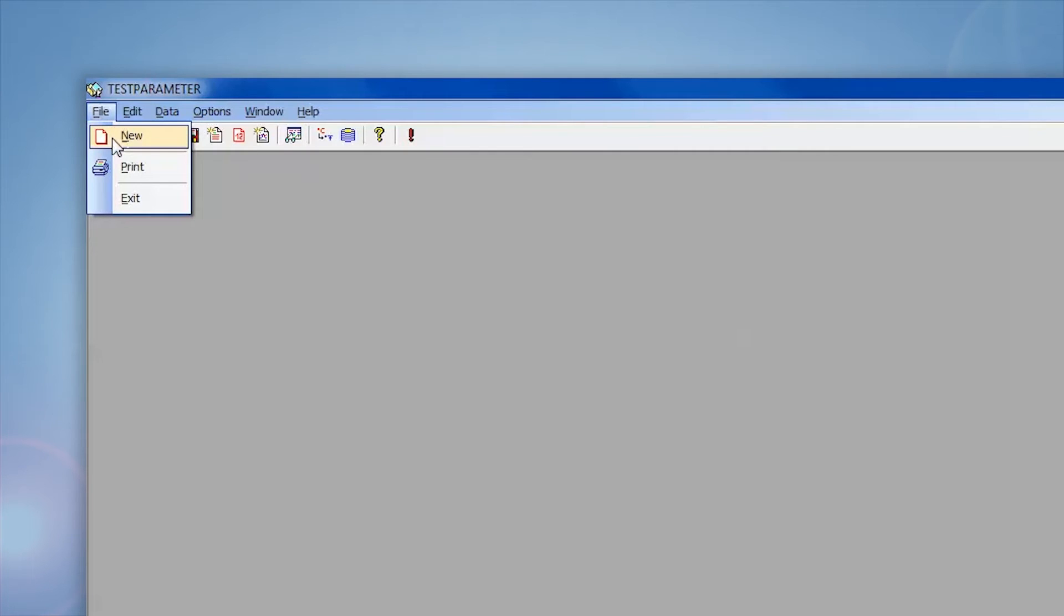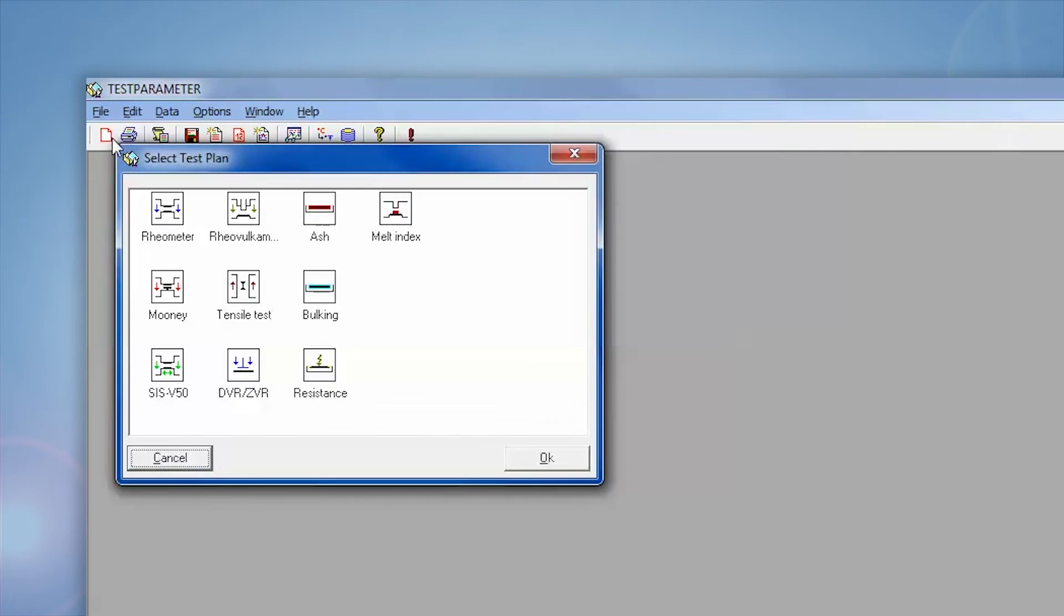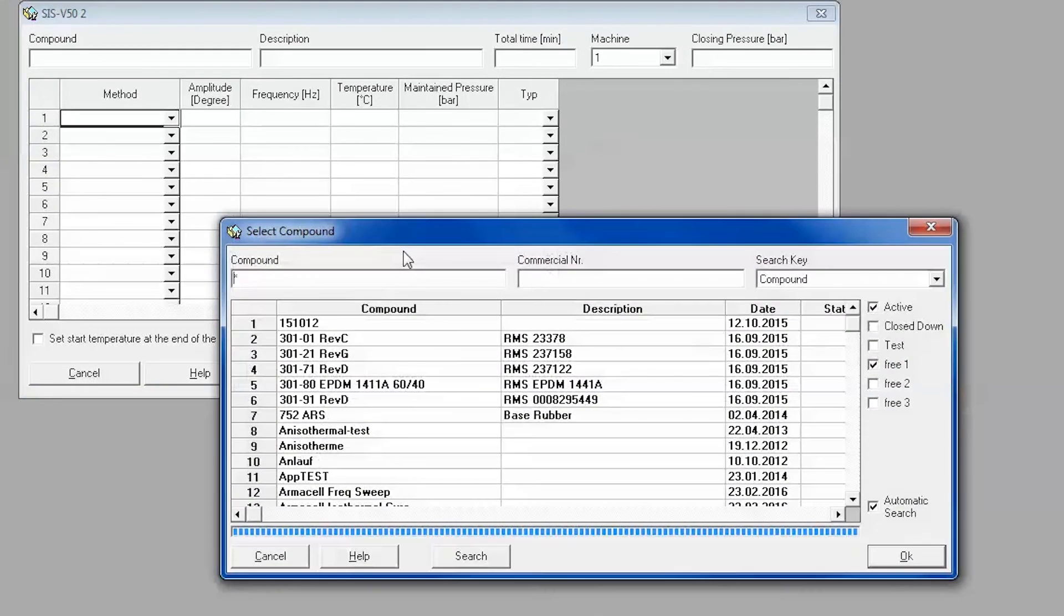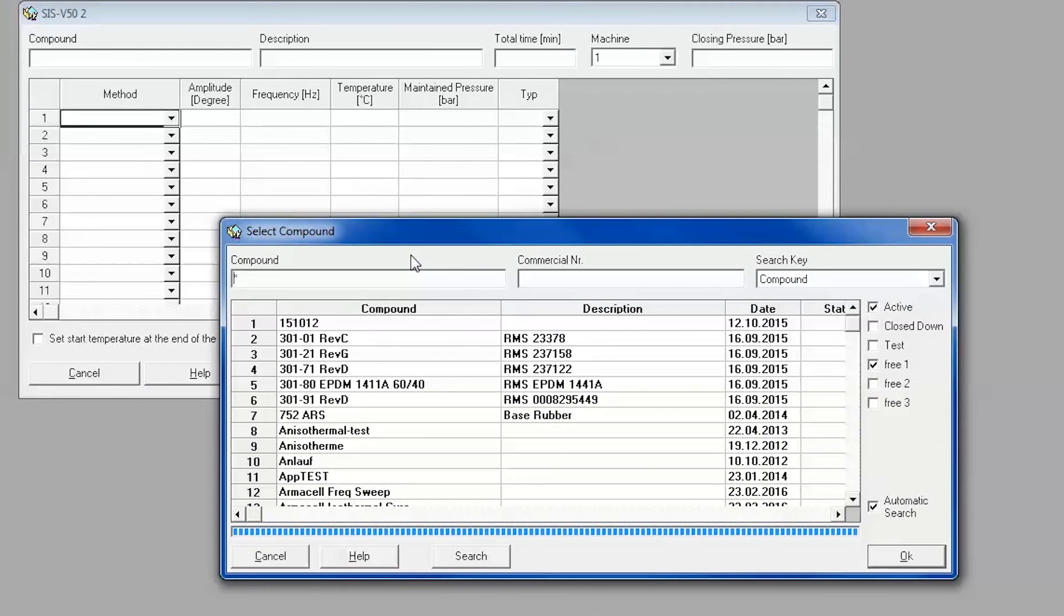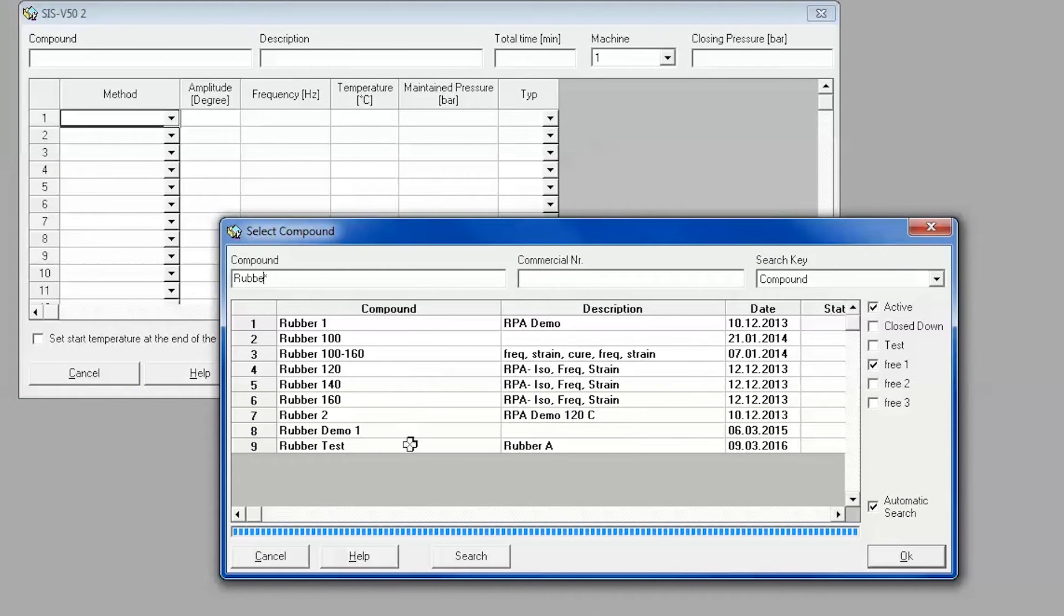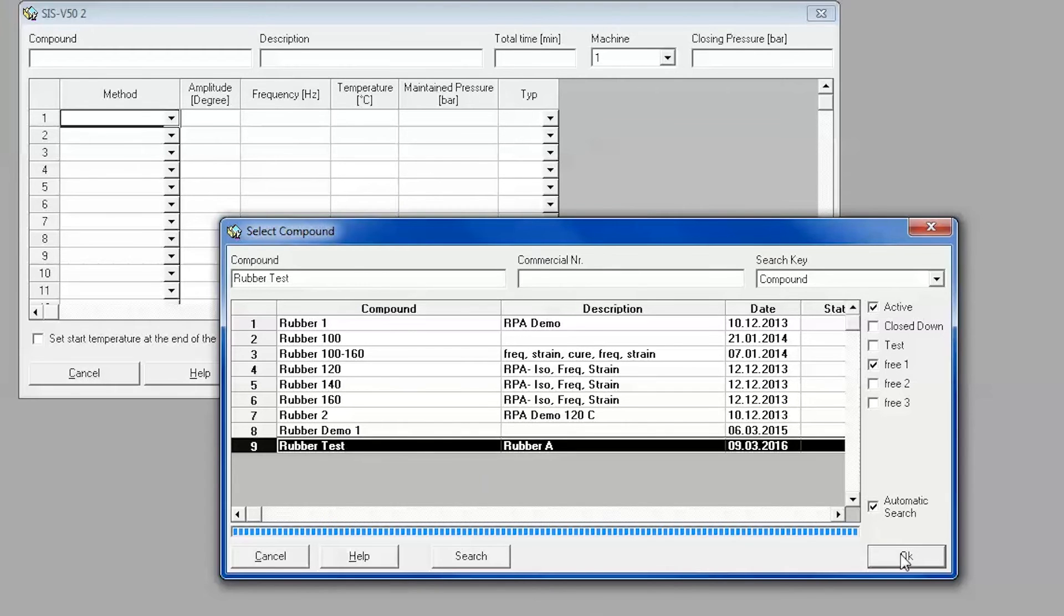In order to create a new test plan, select New from the File drop-down menu or select the New Document icon. In the pop-up menu, select SIS V50 for creating any RPA test plan. You will then need to select the desired compound and select OK.